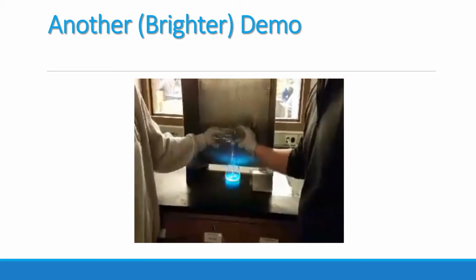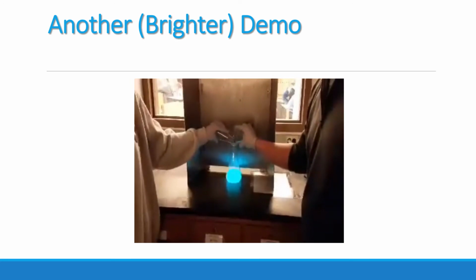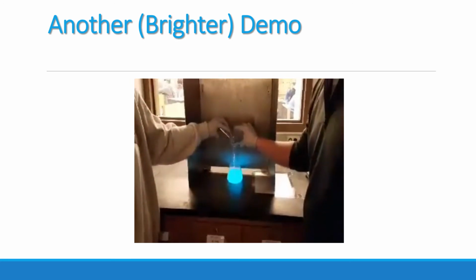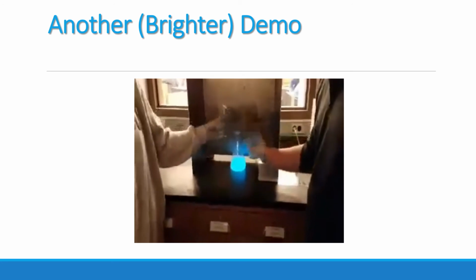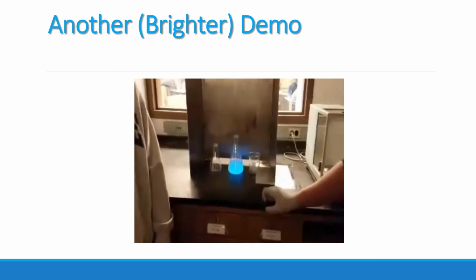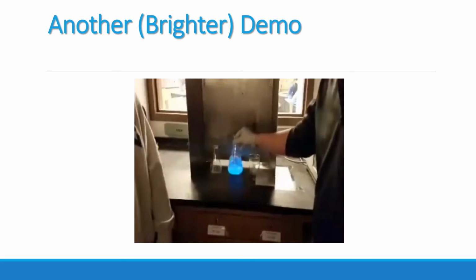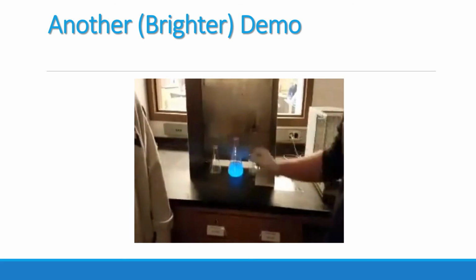Oh my gosh. Wow. This is definitely the coolest thing we've done all year. Wow. That's awesome. I'd say it works, guys. We did it right. Woo! Science. Oh my god. I don't think we could have seen that without the swirlies. Swirl it? Oh, that's cool. So cool.